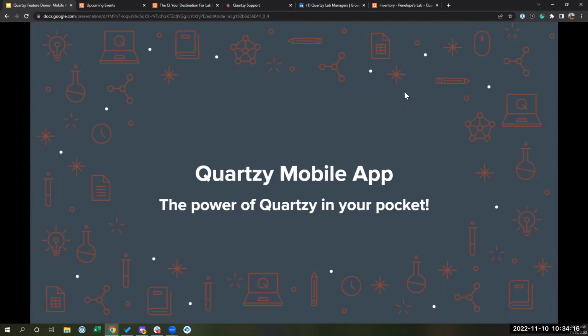Yeah, that's a great question. I think in the future, for sure, we have aspirations and plans to basically get all of Quartzy onto the mobile app someday. Right now, it's really focused on what are the main use cases that being mobile as a user in a lab can really help with. So that's why we're focused on the things that Libby will show here in a moment. Global search isn't there today, but that's something that I think we can expect in the future.